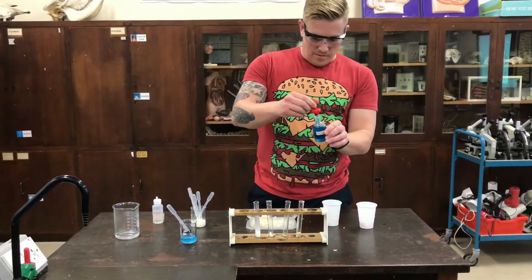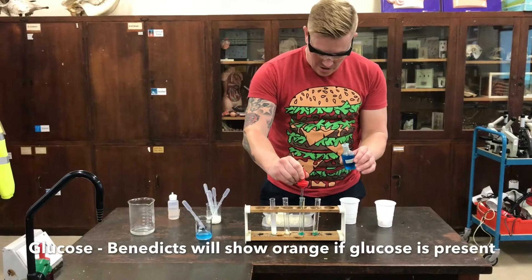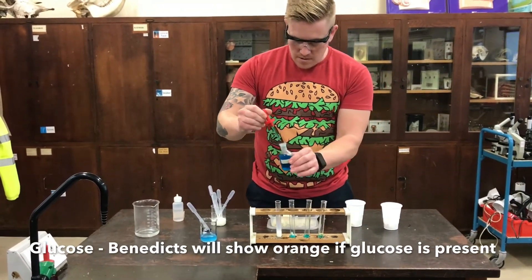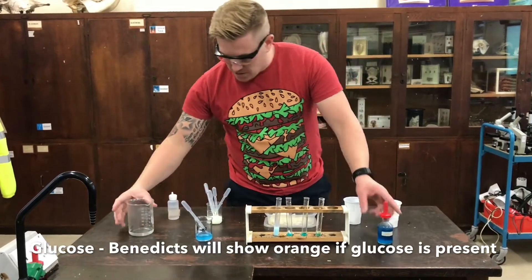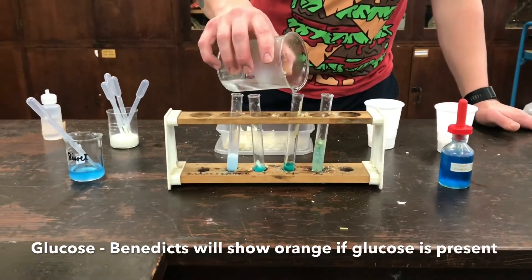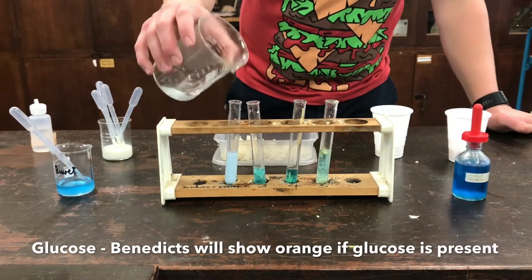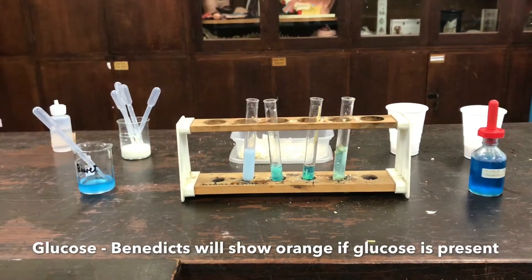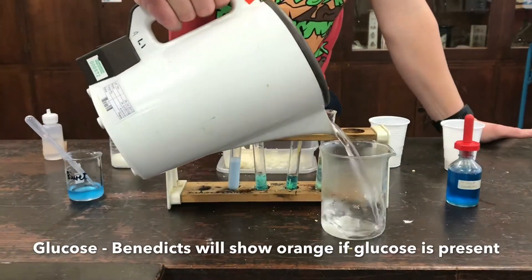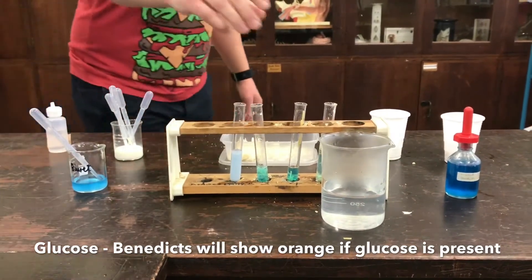For my final test I'm going to test for glucose. I'm going to put Benedict's solution into my food samples. I do aid this with a tiny bit of water — you don't have to, but I choose to — a little bit of hot water just to get things started and help with the breakdown. Then I fill up my beaker with boiling hot water from the kettle, just to bring the temperature up to see if we have any colour change.